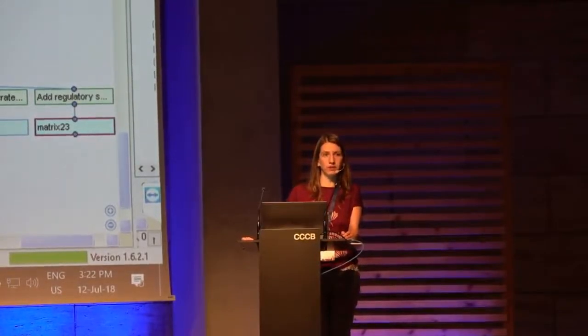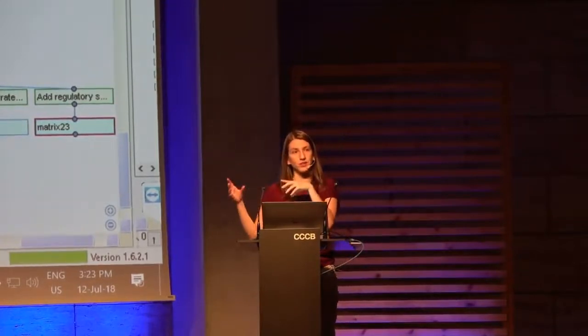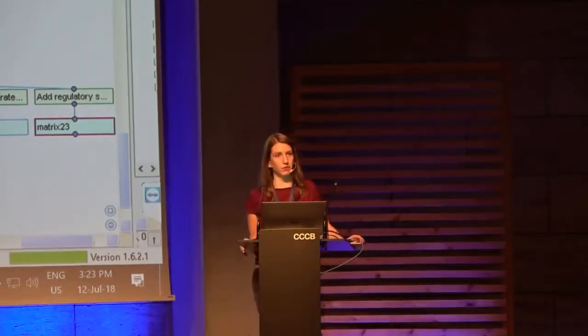However, with phospho data, it depends again if you want to do the enrichment on annotations that are protein or site-specific, because if you do it for protein-specific annotations, you again have to make sure you do this relative enrichment analysis. And when you have continuous or numerical data, this is not trivial, because if you have 5 sites, which one do you take, right? Do you take the most strongly regulated one, the most strongly upregulated one, the most strongly downregulated one, the average? So again, there I would recommend the strategy of splitting this continuous data into quantiles, let's say, and then doing the 1D with relative enrichment in each of the quantiles separately. So it just becomes more complex when you're looking at phospho data, and you need to carefully think about it. But you can definitely do both. It was a long answer.